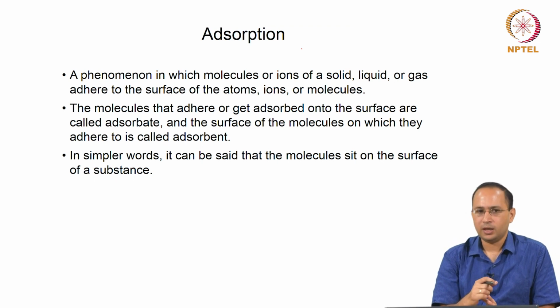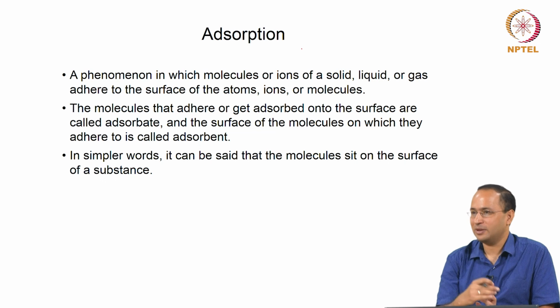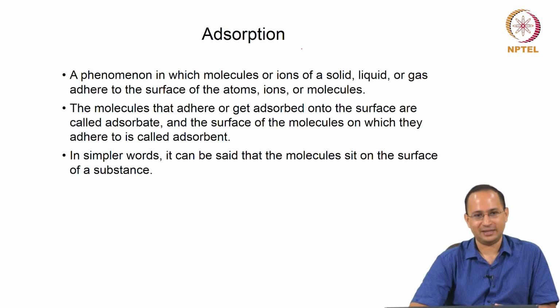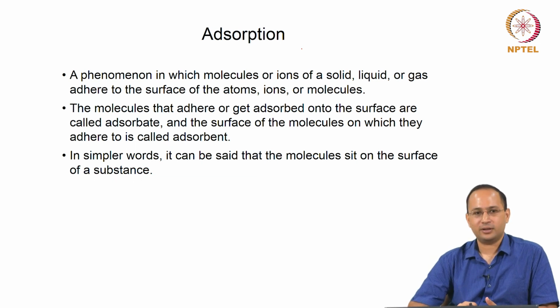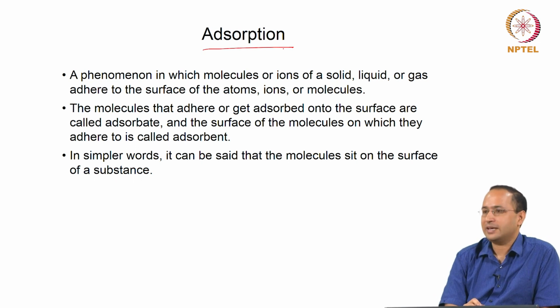If you have high roughness, or if you have porous particles, then your values from laser diffraction will be lower. Now, the idea is how do you capture the true surface area? In reality, you have particles which are irregular, which are porous, which are rough. So, for that we use adsorption, gas adsorption theory.